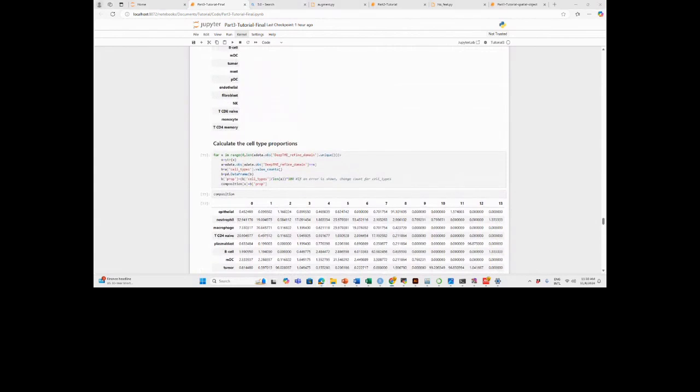And I have another question. I found that there are different clusters with the same type of cell. Can I mix the clusters or join the two clusters into one cluster? You can do that. It depends on you. Since they were identified as different clusters, there might be a few differences between them. So if you want to go into detail and study those clusters individually, I would recommend you assign them, for example, macrophage 1 and macrophage 2, right?